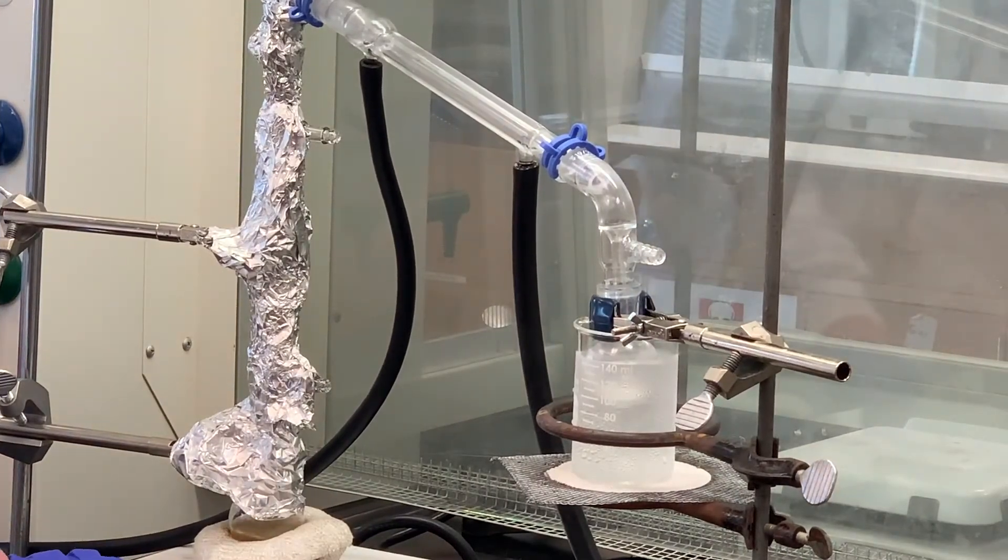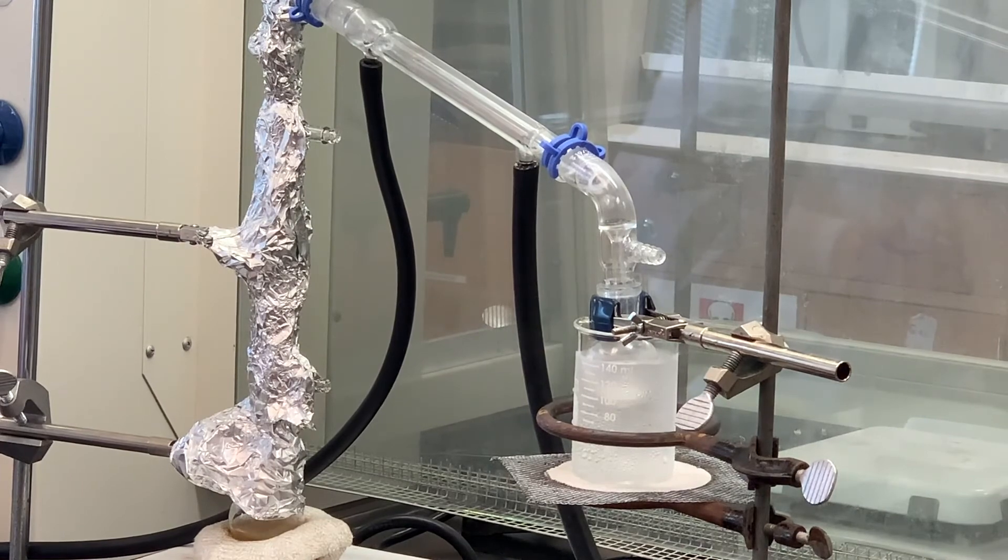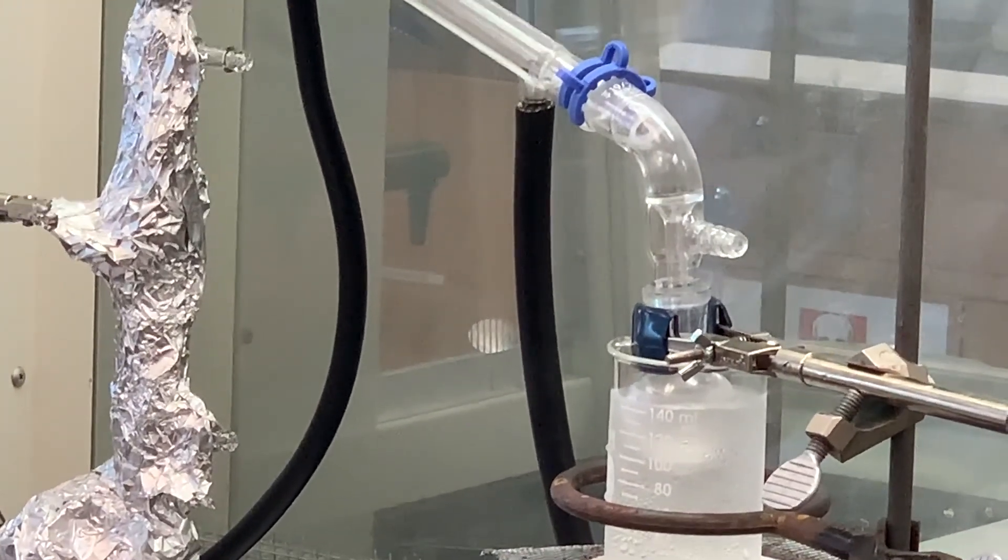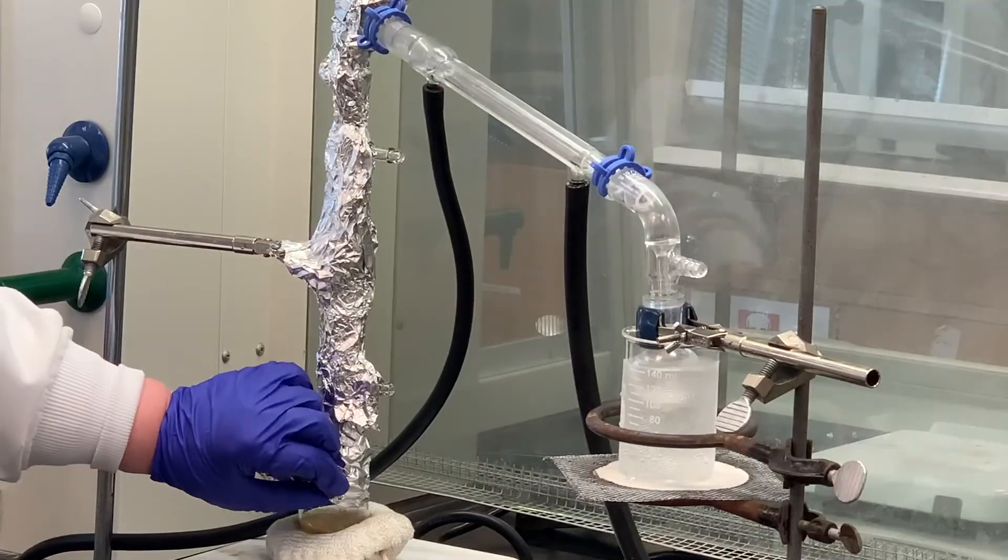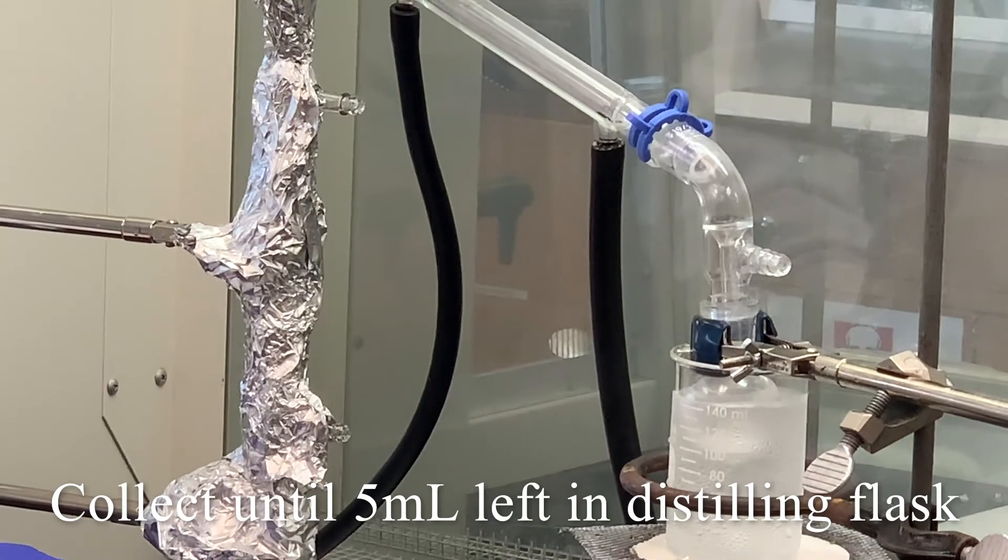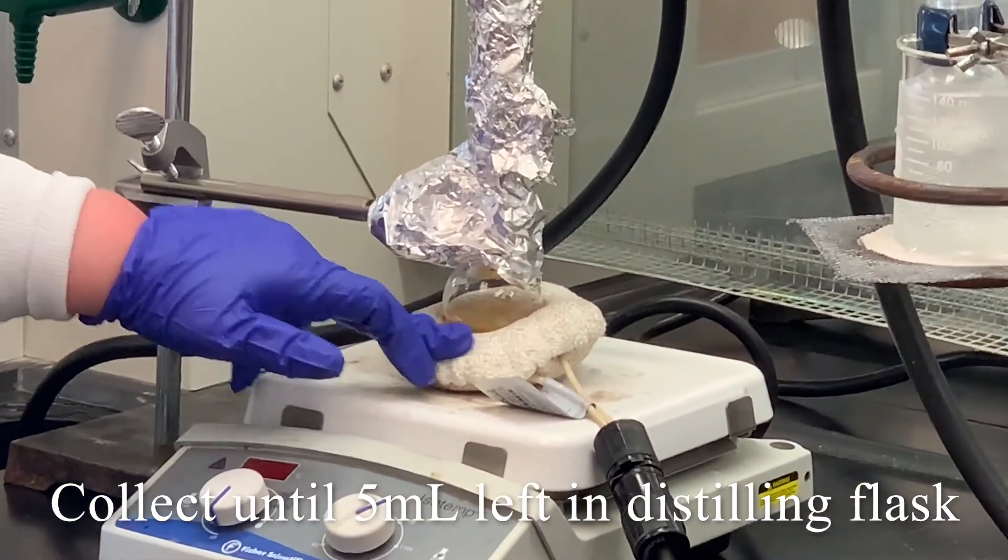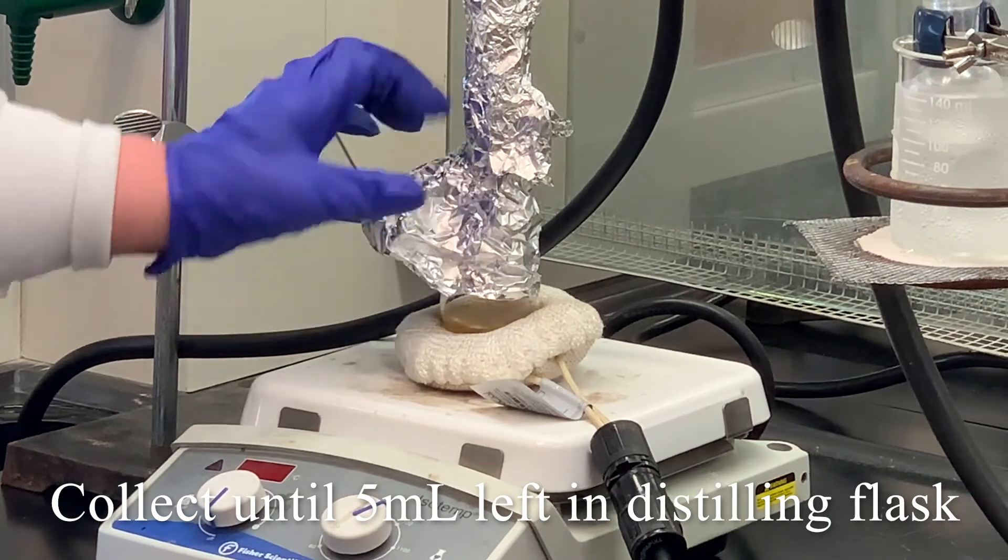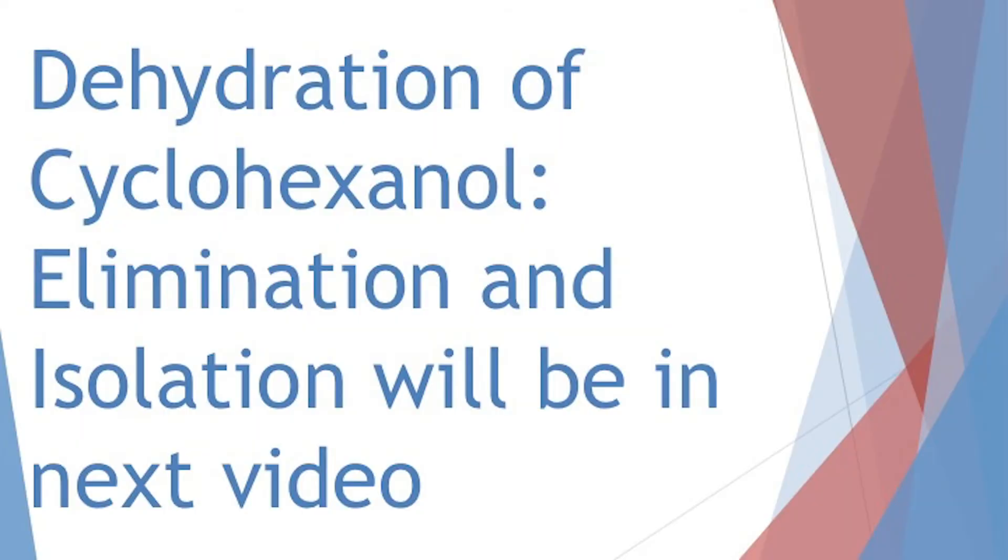Just collected our first drop around 67, 68 degrees. We've got the ice water bath here chilling that receiving flask. You know, by looking at the still pot or distillation flask, there has been a color change. Temperature now is still around 67. We're going to let this continue until about five milliliters are left inside the distilling flask. And then we'll work up our product on the right hand side in the receiving flask.